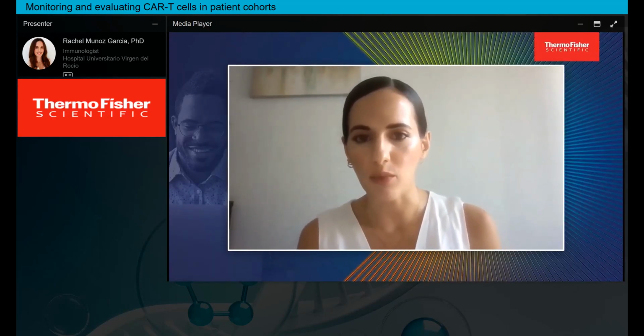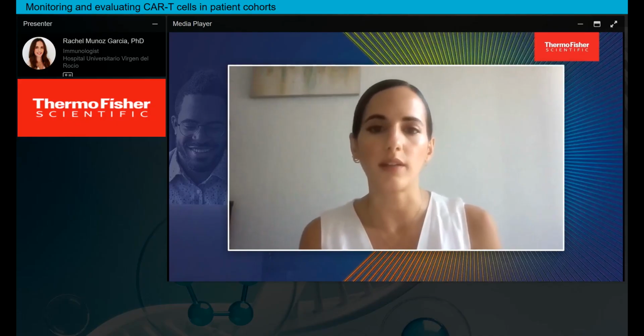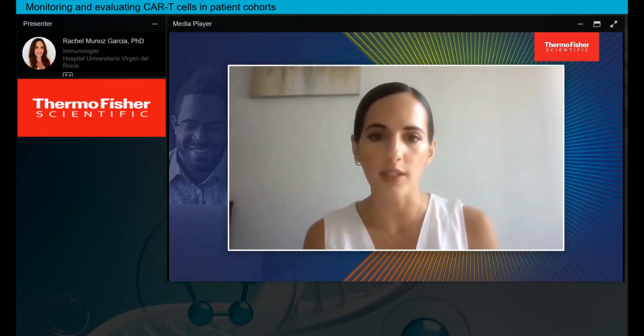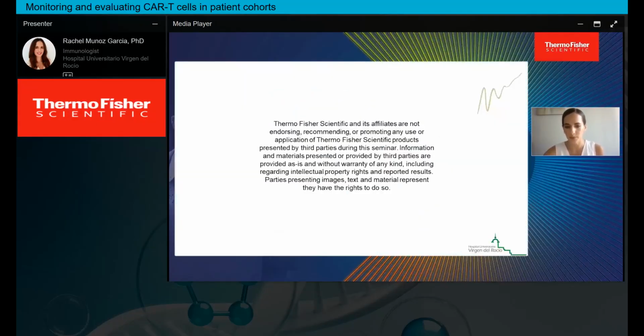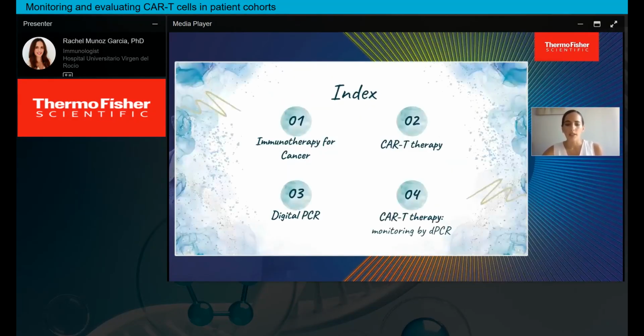Hello, my name is Raquel Munoz, and I'm an immunologist at Hospital Universitario Virgen del Rocío in Sevilla. And I'm going to talk about CAR T-cell monitoring in clinical phase using digital PCR technologies. This is the script that I will follow during the presentation. First, I'm going to explain what immunotherapy for cancer is, and I will focus on CAR T therapy, digital PCR, and how to monitor CAR T therapy with digital PCR.